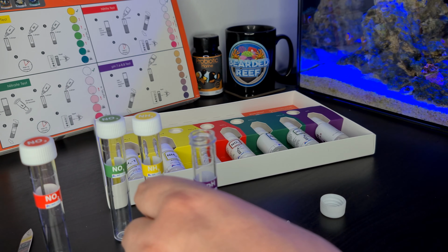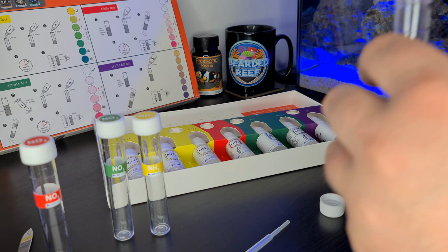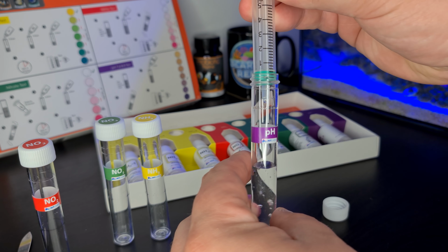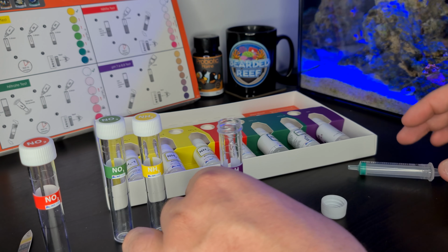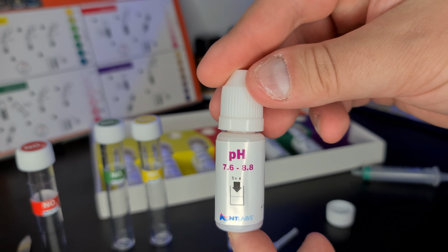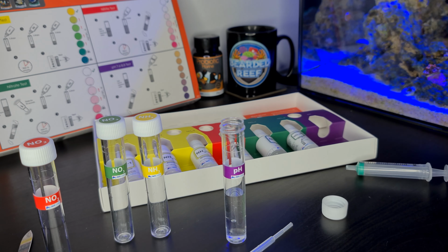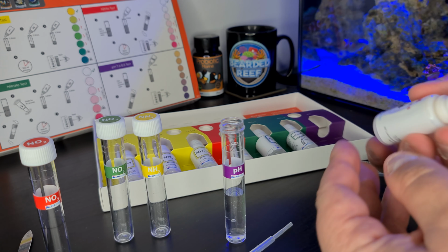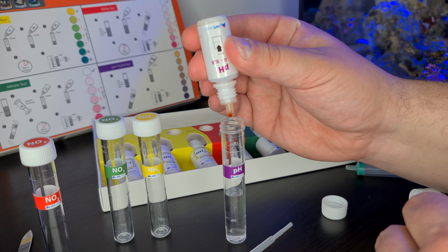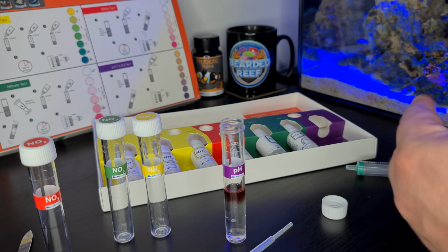So it's saying to add 5 mil of aquarium water, so we'll do that just now. So that's 5 mil there. And then it says 5 drops of this pH solution. So I'll give this a bit of a shake first. As you can see, this does between 7.6 and 8.8. So we'll give 5 drops of this in here. Okay, so that's 5 drops of the pH solution in.